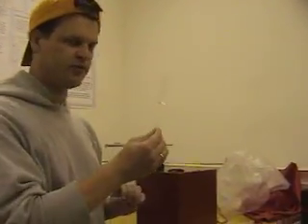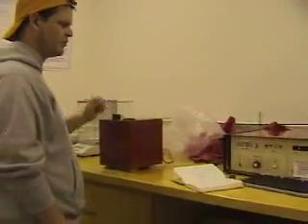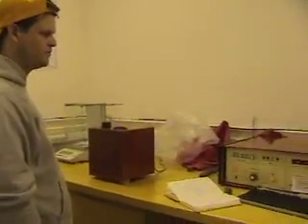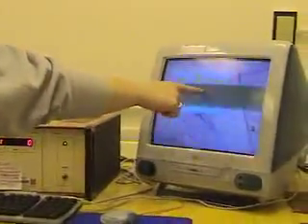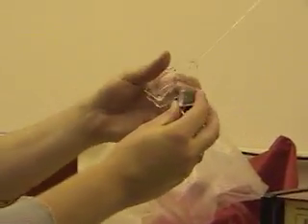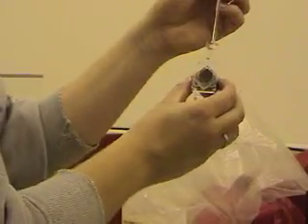So first we're going to go ahead and calibrate our sample holder. It says ready, hit measure, goes to measure, and we drop in the sample holder. Alright, it seems to like that. So we recorded our sample holder range, and so now we're going to measure our first sample. And we're going to load up the sample. In this case with cubes, my primary arrow here is in dashes, and I'm going to put that in the sample holder. So it's loaded in just like that.